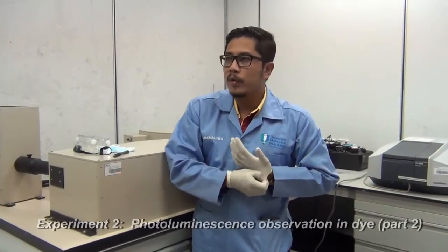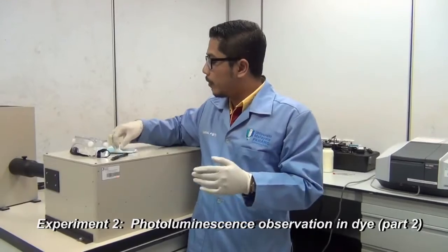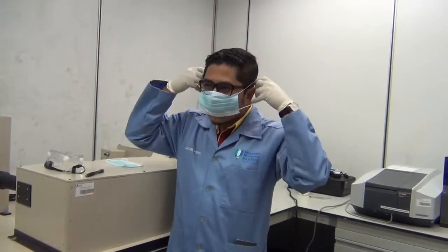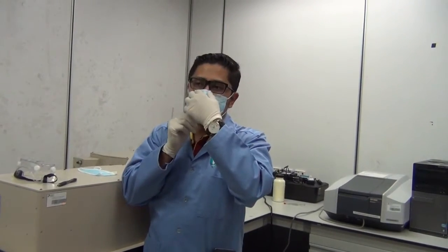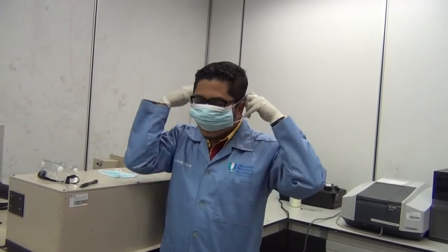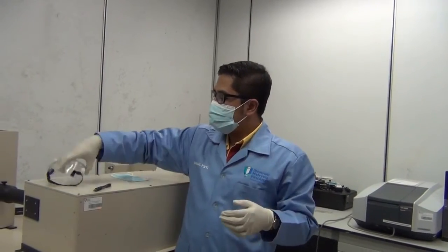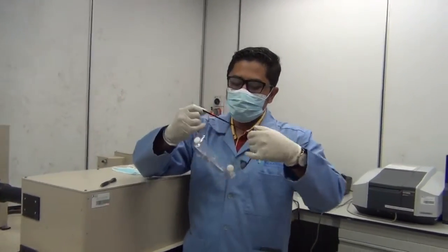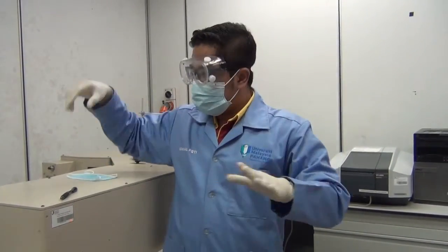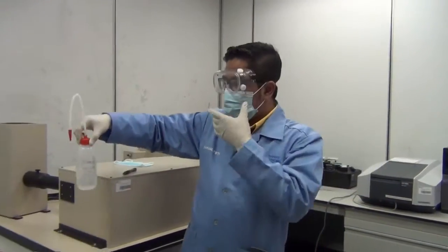And make sure after you have worn your gloves, if you are going to use powder, make sure you wear a protective mask just like this. Very easy to wear. It's just the other way around. This is the correct procedure. And also don't forget to wear goggles. This is not Google, this is goggle. Now, because you are going to play around with ethanol or any solvent, don't forget your goggles and facial mask.